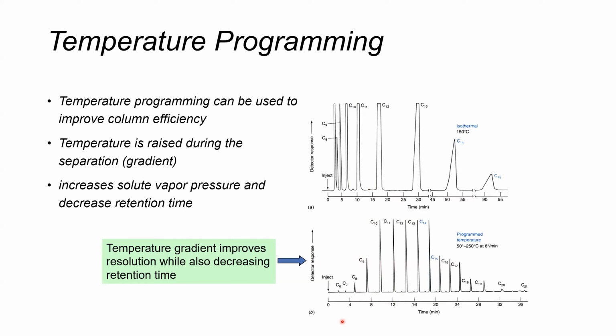So we can see here that initially, of course, we get the complete elution of short chain hydrocarbons, or at least short chain for this mixture. And those then come out sequentially. So as we increase the temperature, we see that we get different carbons of different length.